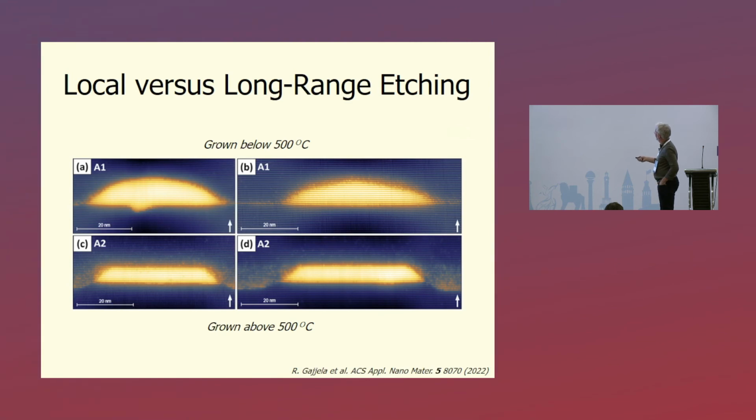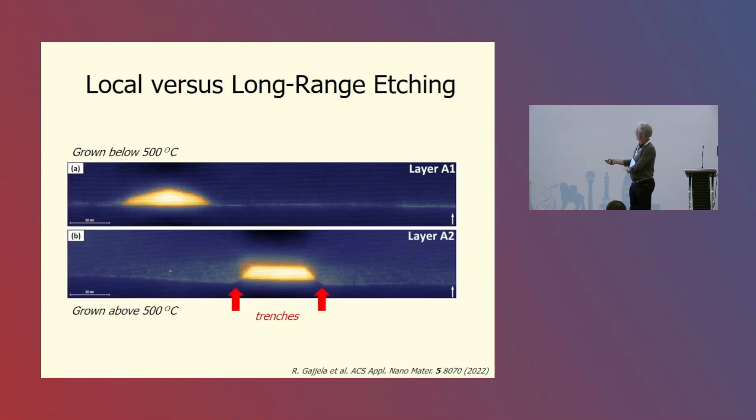You can see already here there is some kind of steep edge, where here we have the pure indium phosphide, but here is the intermixed wetting layer, and our dots stand on a kind of terrace. There's trench formation around the dots. I've put circles around it here. Here you again can see these trenches that form around the dot if you grow at 500 degrees centigrade. Something you also do not like and would like to prevent.